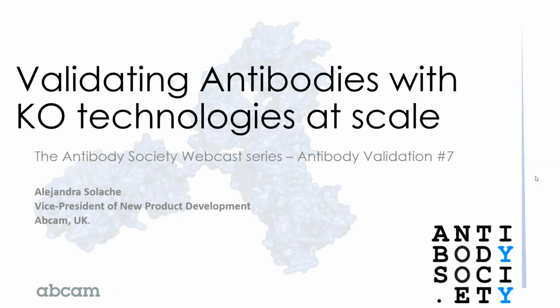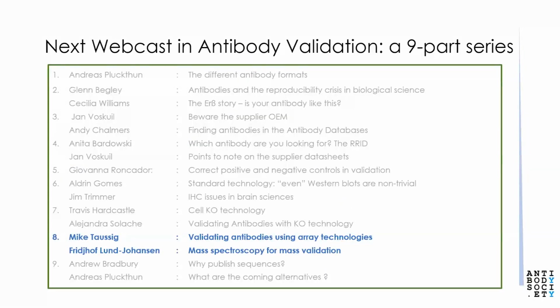Yes, thank you. I think that's very valuable. So we've seen that gene knockouts in cell lines are a powerful tool for validating antibodies. They're versatile because they can be used in many common cell biological techniques and proteomic applications. And of course, now we've seen that many validated knockout cell lines and lysates are commercially available. So in the next episode of the webcast series, we will look at some less conventional methods for validating antibodies: protein arrays and IP mass spectrometry.